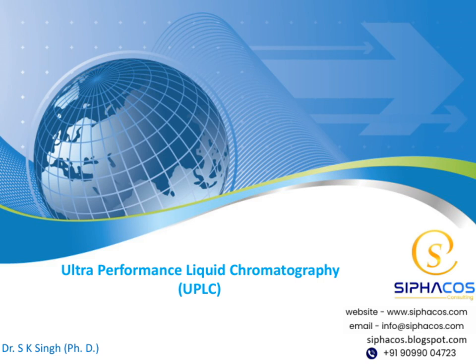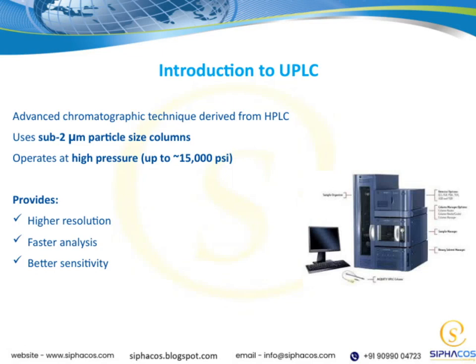Today, we'll be exploring the fascinating world of ultra-performance liquid chromatography, or UPLC for short. This presentation will cover the fundamentals of UPLC, its advantages, and how it's transforming analytical chemistry. I look forward to sharing insights and answering your questions along the way. Let's get started. Welcome to our introduction to UPLC.